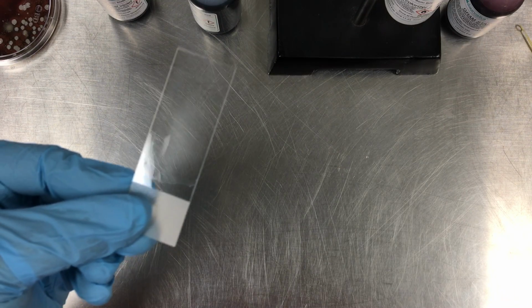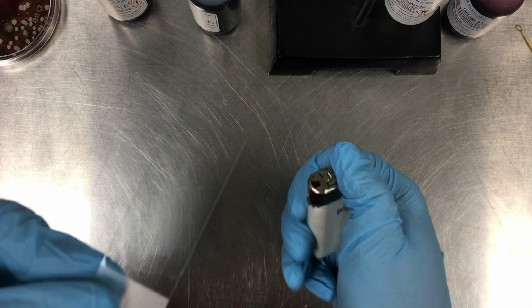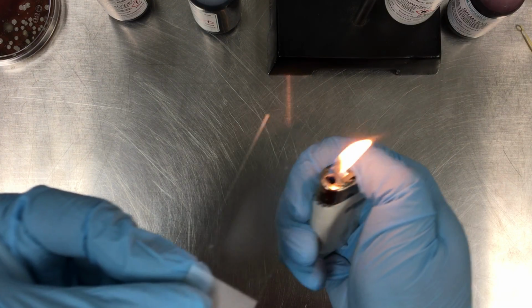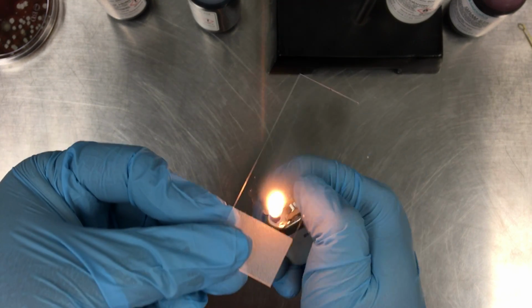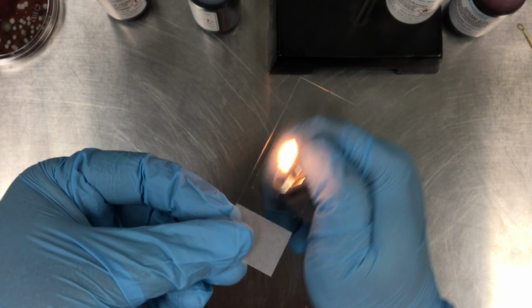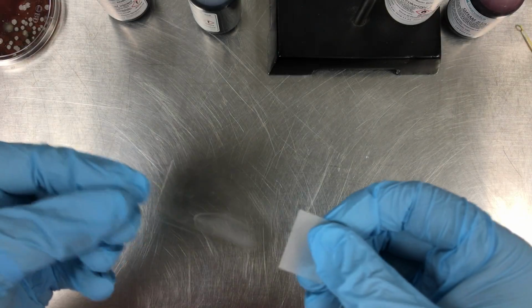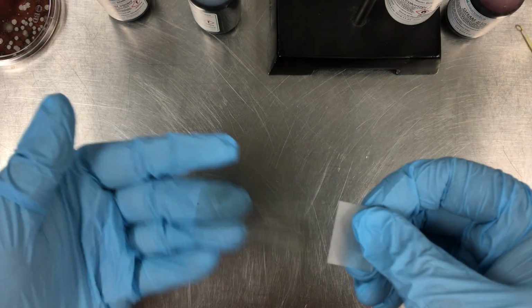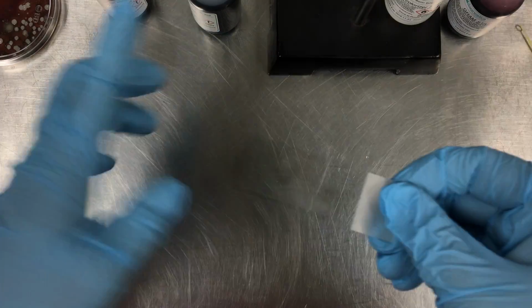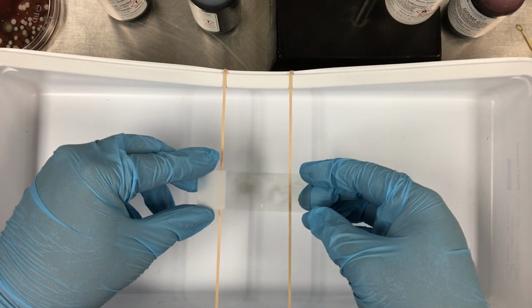Now that that's been done, you can let this air dry, and then the next step is going to be to fix it. So use a lighter to heat fix the bacteria to the slide. You just need to apply enough heat until you see that the sample is dry. And if you wish to, you can take a piece of gauze and you can wipe the soot off of the back of the microscope slide. Now we're ready to gram stain. So place your microscope slide sample side up on the tray.